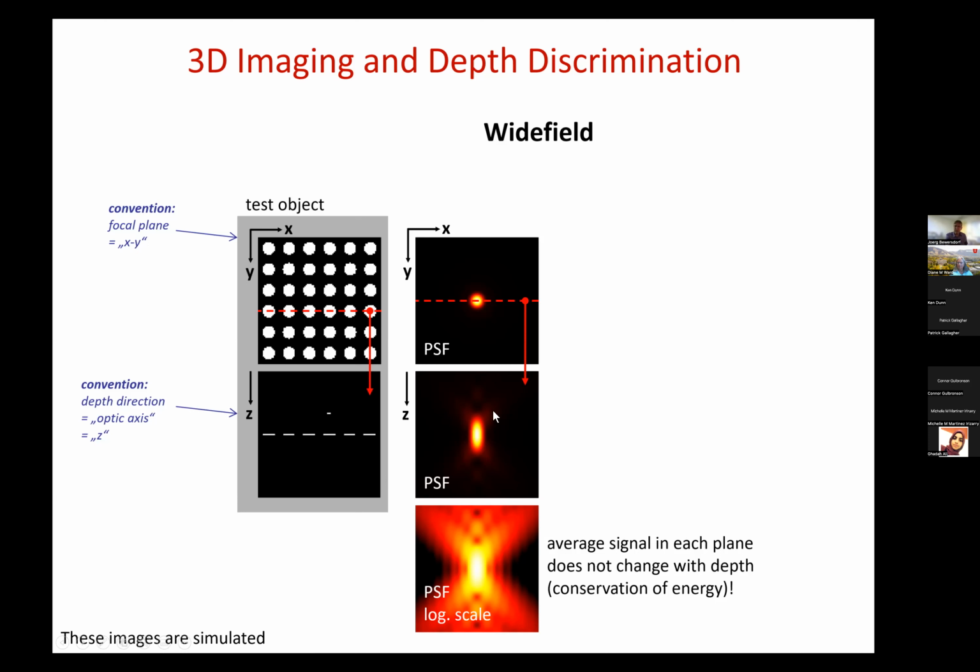But you can still argue, well, it's not that much. So what's the big deal? Well, the problem is that while it's not a lot above here, it covers a large area. And this large area will illuminate a lot of different objects. So now you get a little light from many, many objects. And that adds up to a lot of background.